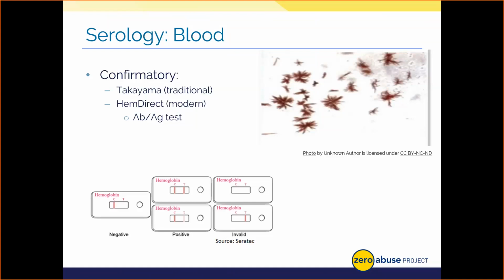Our old method of antibody-antigen testing involved pitting antibodies against possible antigens, again, human blood in this case, in a petri dish, and we had to wait for a whole day. Whereas the HemeDirect method only takes a few minutes. So if blood is applied to this testing cartridge, it'll turn colors akin to a pregnancy test with lines indicative of your final result, which you can see here.